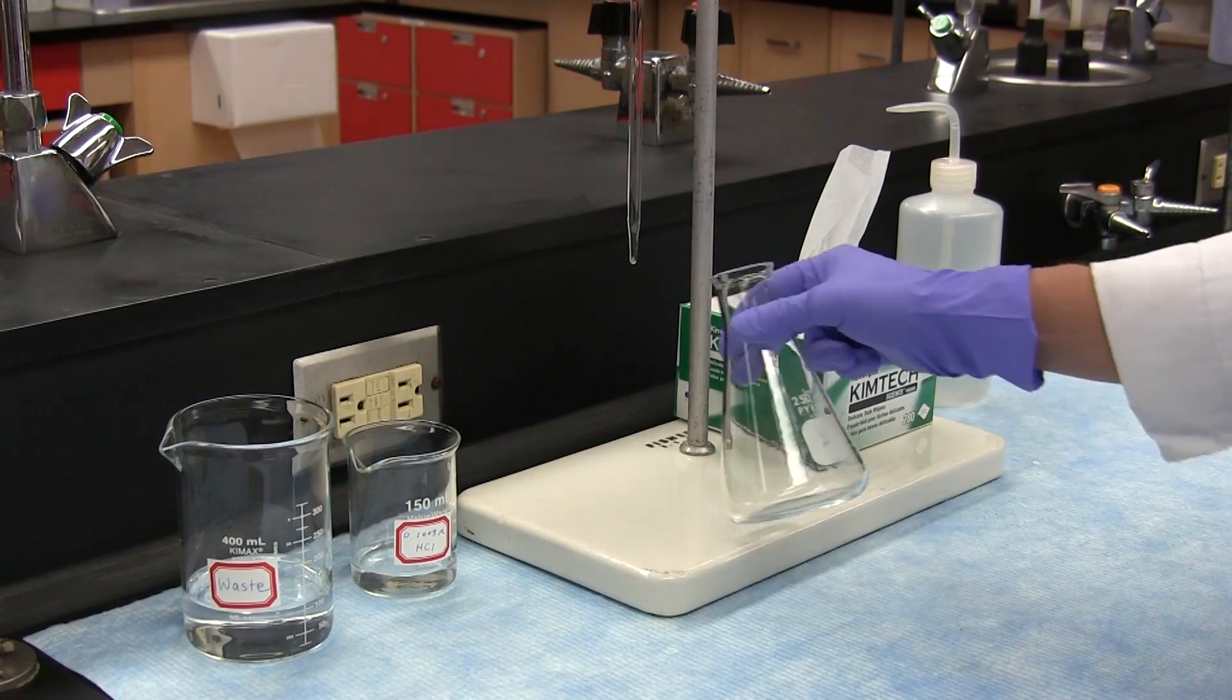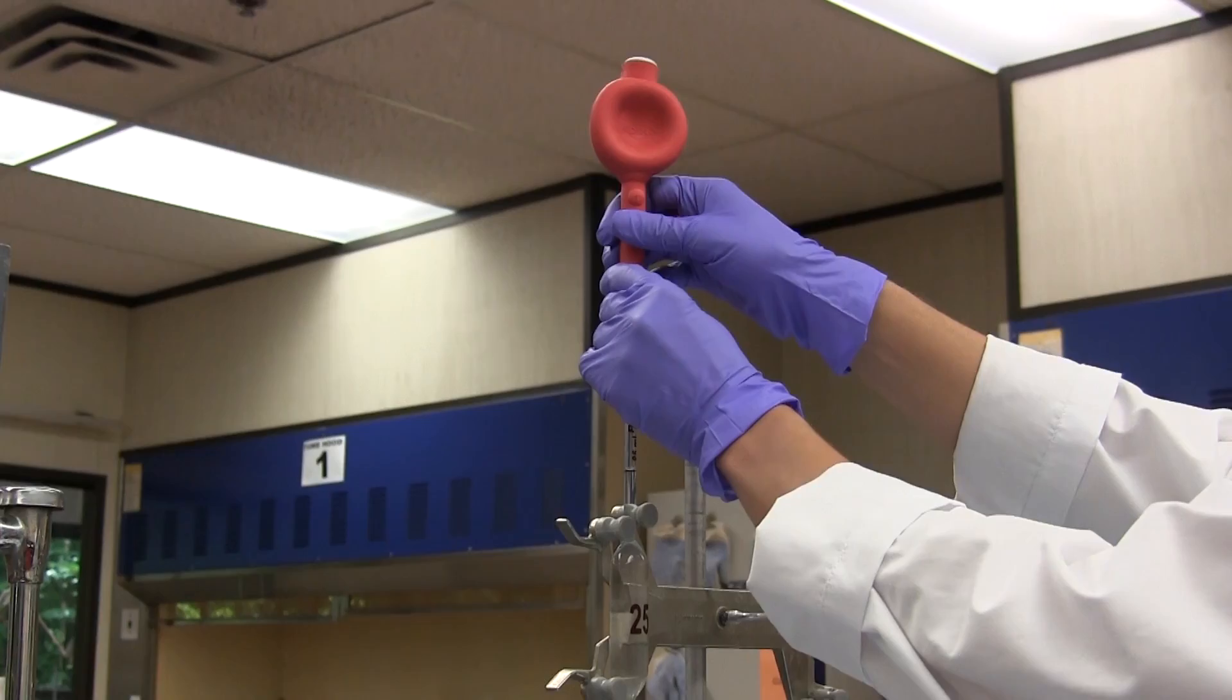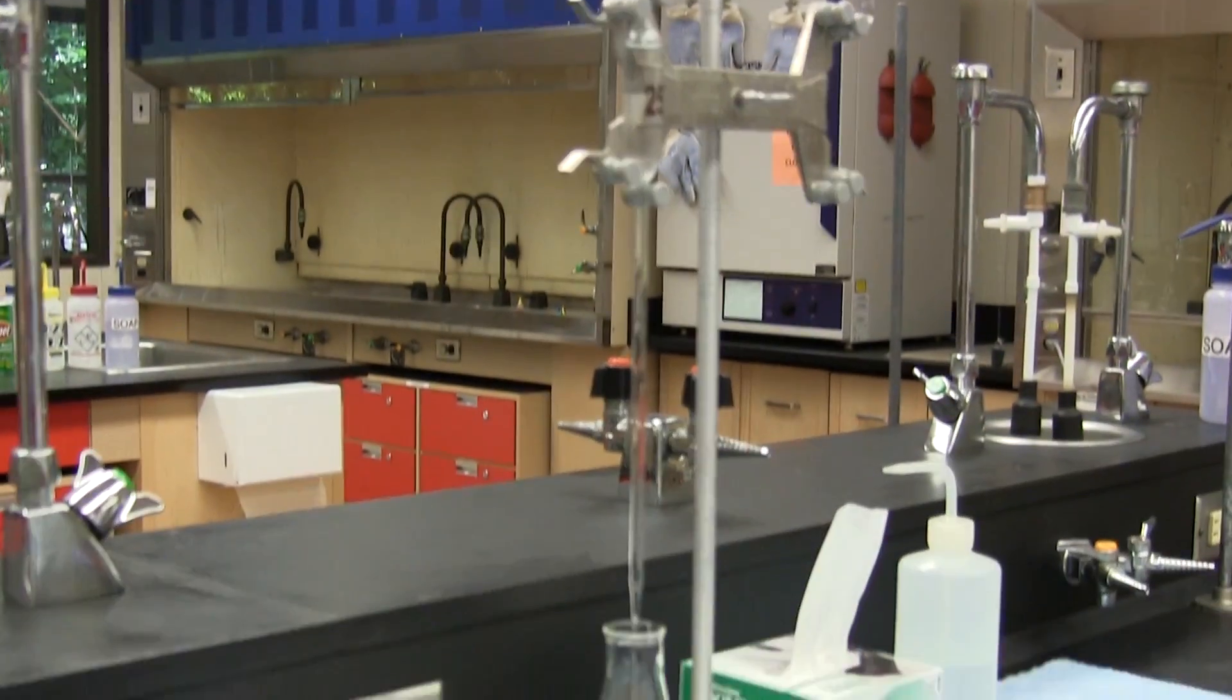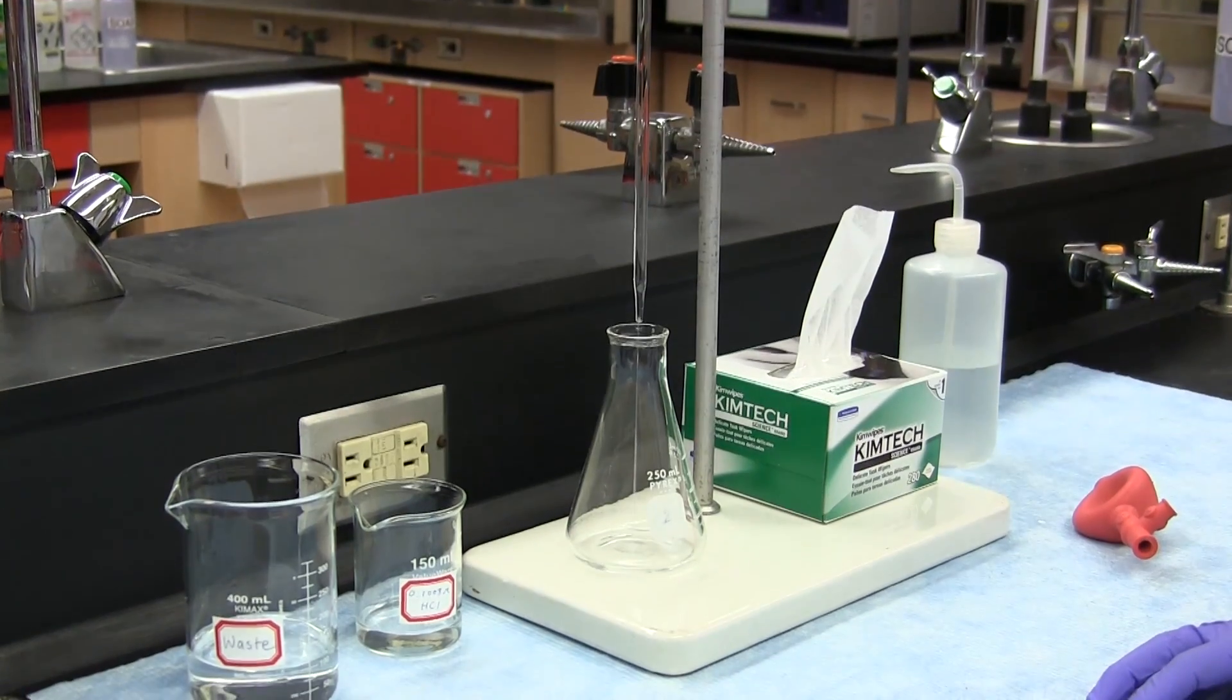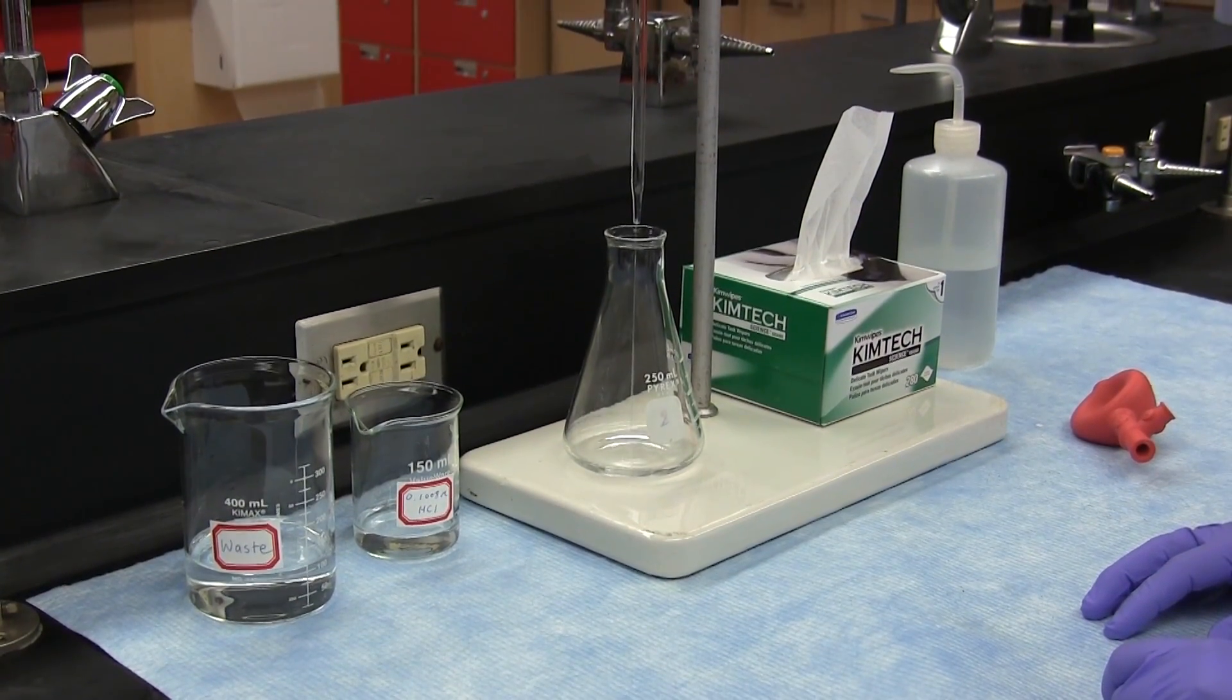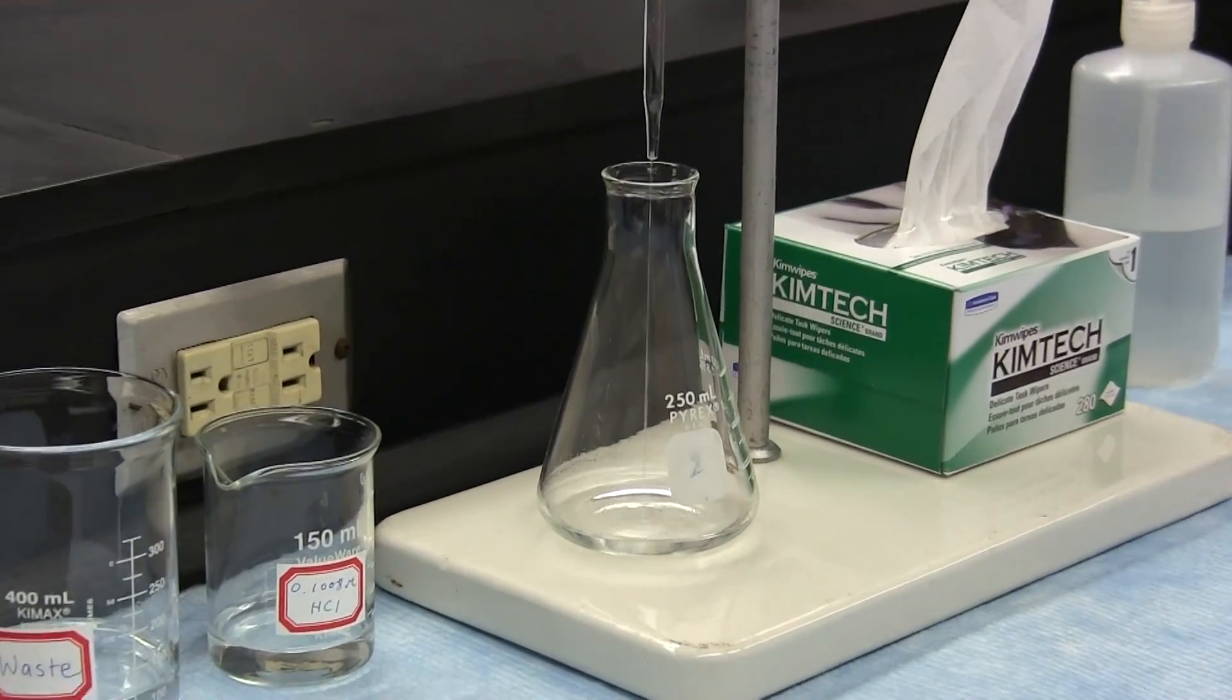The receiving vessel, in this case an Erlenmeyer flask, is then placed under the pipette and the pipette is allowed to drain. Don't allow the pipette to touch the glass or to be immersed in a liquid during the draining process. The pipette should be allowed to drain its contents by gravity alone.